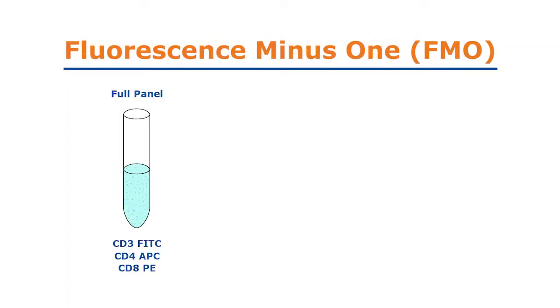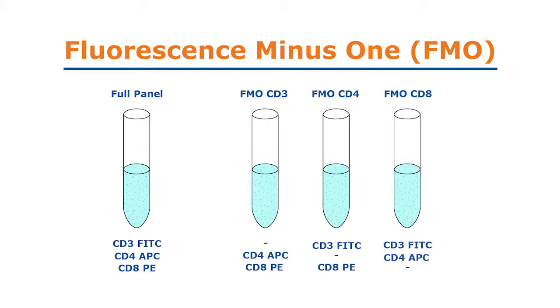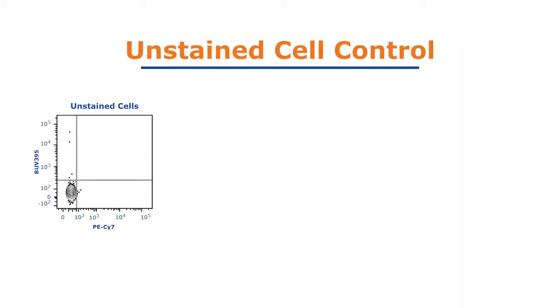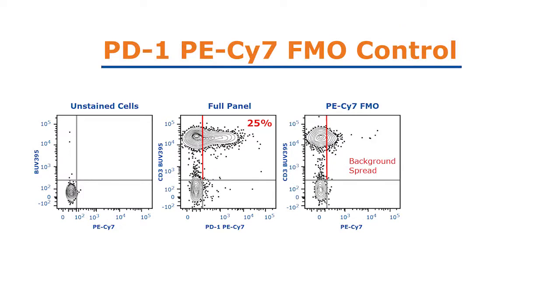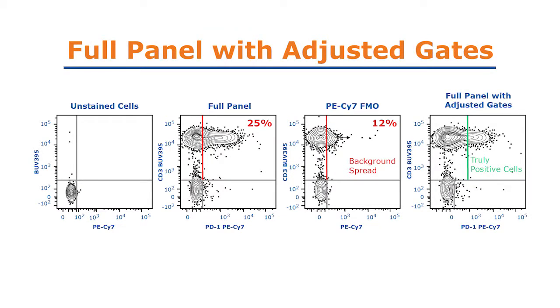In this example, we show the importance of fluorescence minus one controls, defined as a cocktail containing all the antibodies in the panel minus the one for which an appropriate gate needs to be determined. First, the unstained cell control was used to set the gates. The next plot showed the cells stained with the full panel. According to the gates set based on the unstained control, 25% of CD3 positive cells are also positive for PD1. However, the use of FMO control containing all the antibodies except PD1 reveals additional background introduced by other fluorochromes. This accounts for 12% of cells that were wrongly considered positive in the previous plot. When we adjust the gates based on the FMO control, we are able to more accurately measure truly positive CD3 positive PD1 positive cells at 13%.